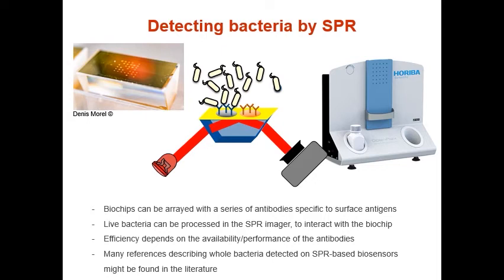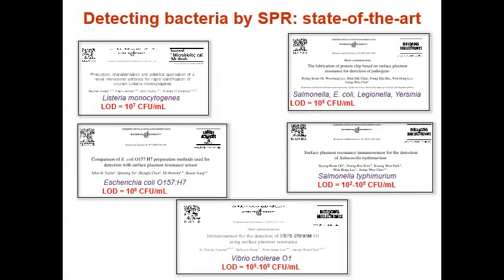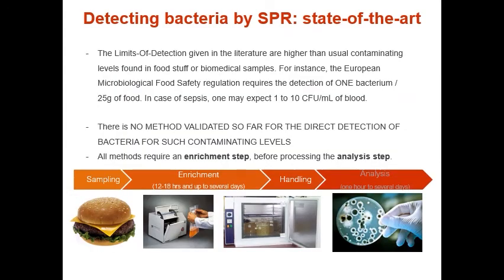Anyway, if you look at the literature, you may find several publications describing the detection of whole bacteria by surface plasmon resonance. Here are a few examples of such papers. As you can see, several highly relevant pathogens might be detected, such as Listeria monocytogenes, E. coli O157:H7, Salmonella enterica, Yersinia, and so on. Another interesting thing about these publications is the limits of detection given in these papers. Indeed, most of the limit concentrations required for detection are in the range of 10 to the 2 up to 10 to the 9 bacteria per milliliter.